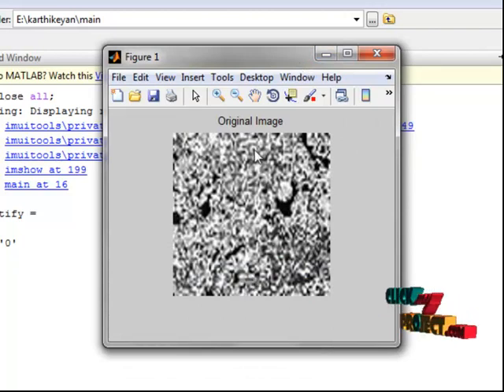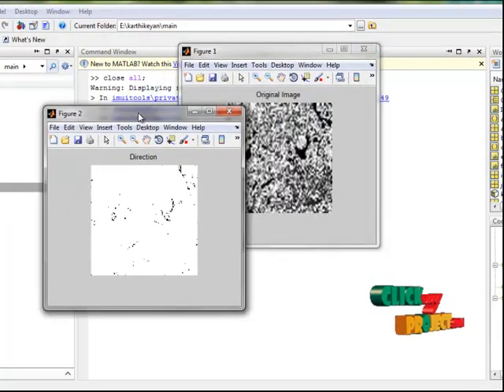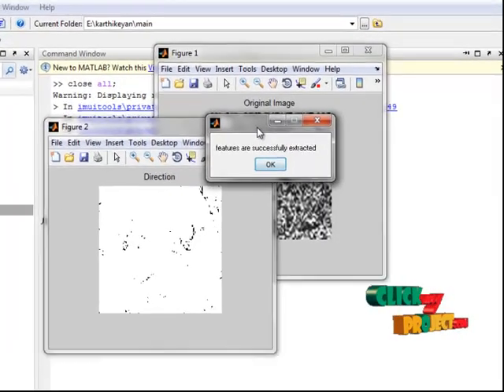We construct a tensor of polar separable filters optimizing the radial part to the periodic pattern of the tissue. Due to their efficient computation, we employ polar harmonic filters. This analysis is performed in a multi-scale framework. And the next one is directionality finding. Features can be extracted from the tensor B. This is our feature extraction.